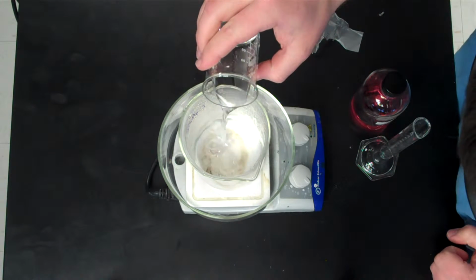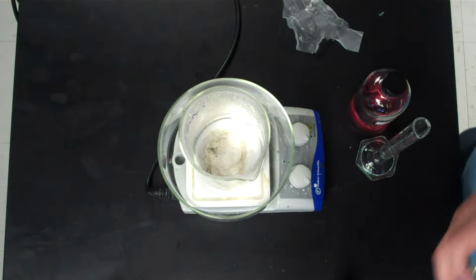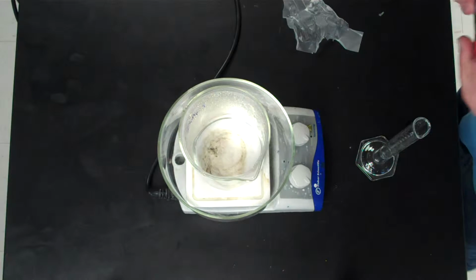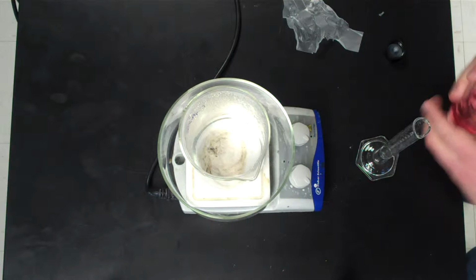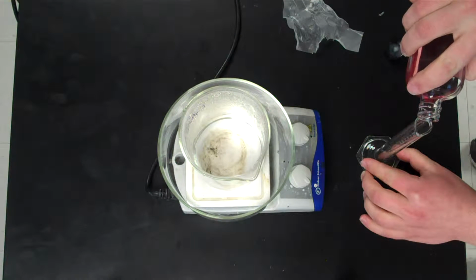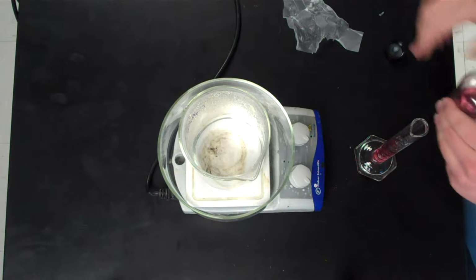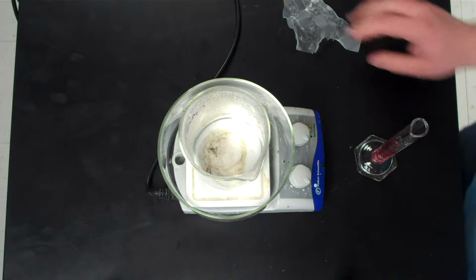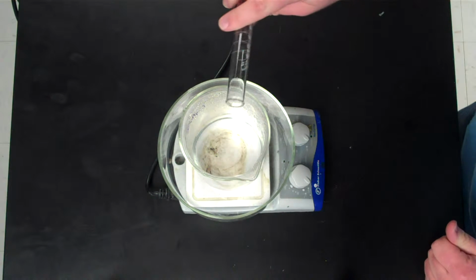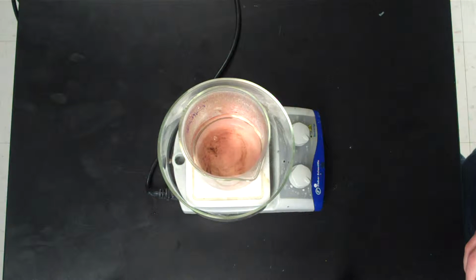As you can see, there's no reaction taking place yet. The solution's still nice and clear. There are no bubbles evolving out, and it's just sitting there. And to that, we add 15 milliliters of our cobalt chloride solution. It's nice pink. We add it in, and the color change is pretty quick. It turns a sickly greenish brown color, because it's turning green and the pink of the catalyst are mixing strangely. Then you give it a little bit of time to start to react, and you can see a bunch of bubbles start to evolve.